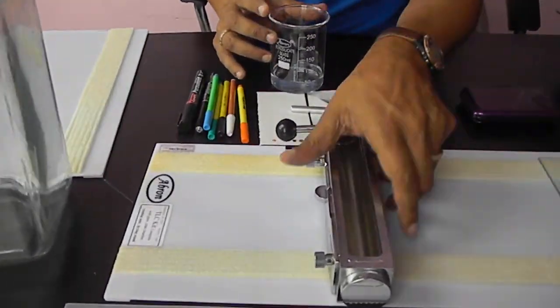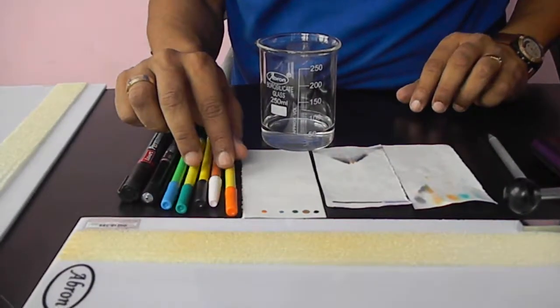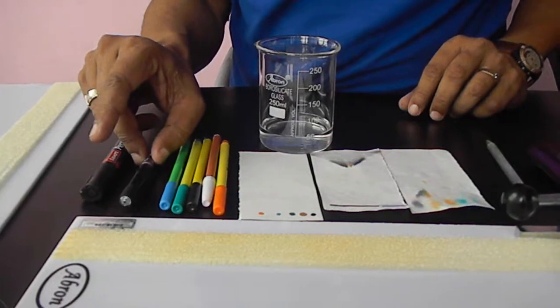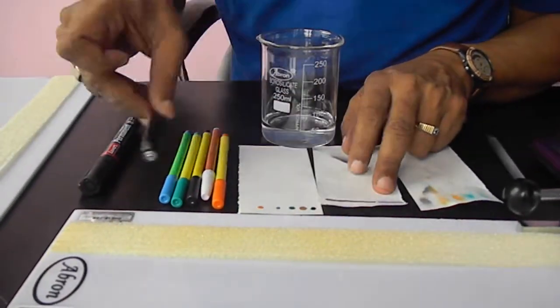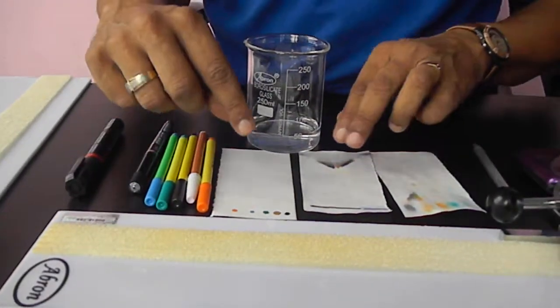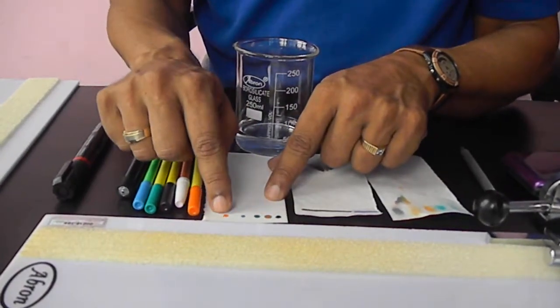Now I want to show you one experiment which I have done just in the morning. There are different water soluble pens. This is a permanent marker, not water soluble. Again permanent but a little water soluble. This line is with this pen, and this line is with the permanent marker. And there are dots I have put. They are water soluble marker pens. I have put the dots.